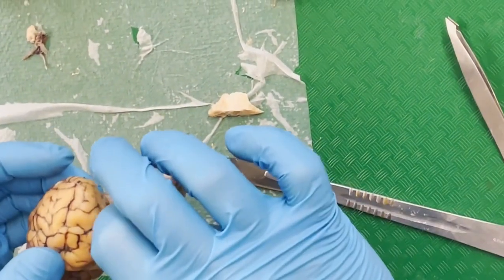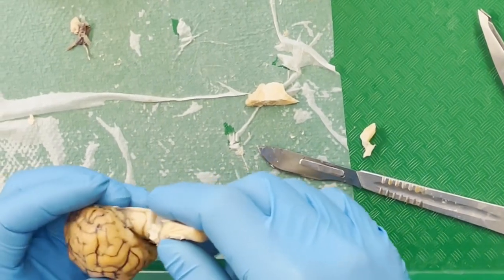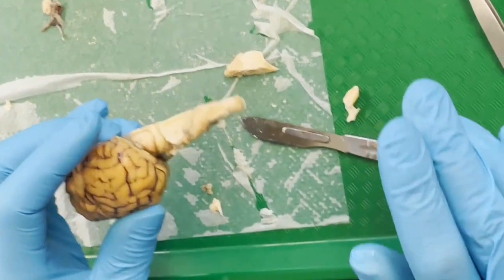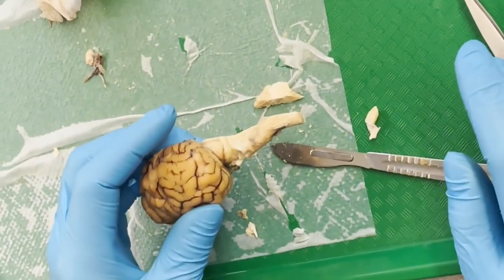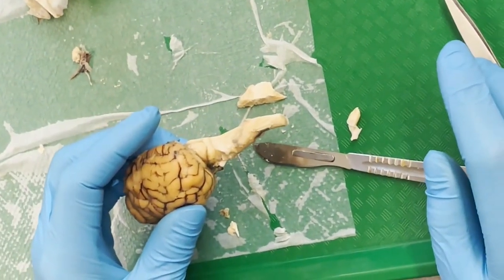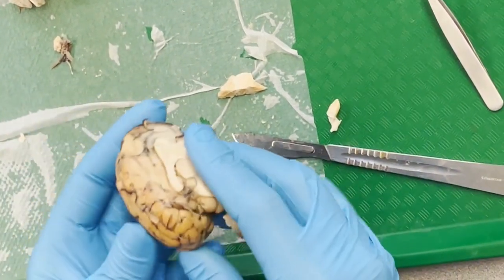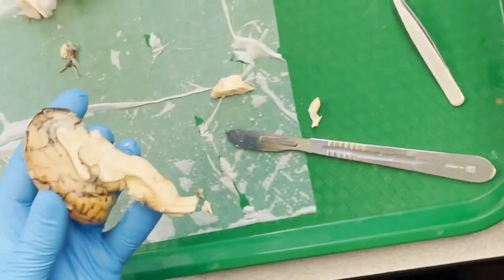Alrighty. So now we've exposed the dorsal surface of the brainstem. In this case, it's half of it. So if you would like to coordinate with one of the other tables around here to, with your powers combined, form a full brain again, you will be able to see the viewpoint that you end up seeing on page 13 here.